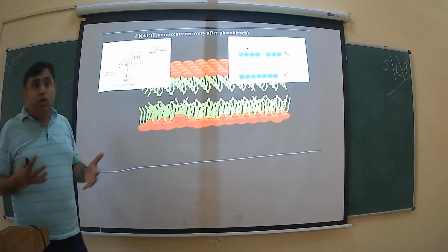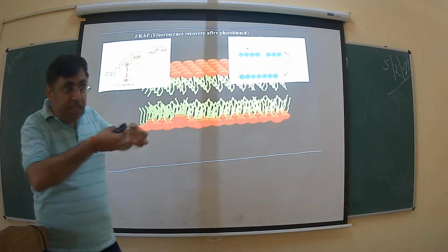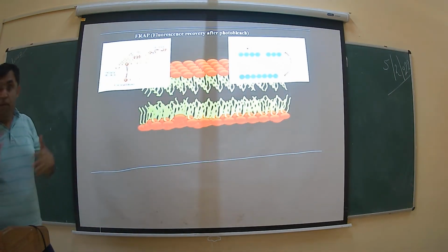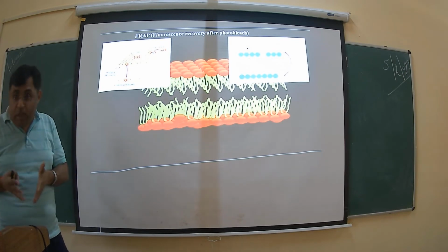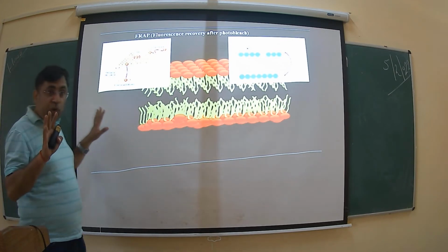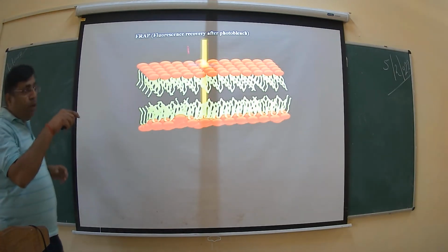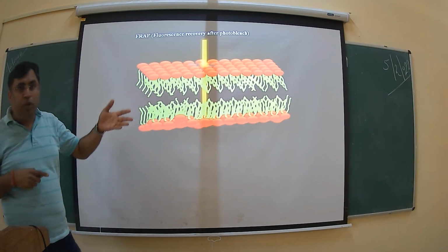So what is the diffusion coefficient? The movement of a protein molecule in a particular structure, you measure through FRAP, fluorescence recovery after photobleaching. Okay, FRAP. You got this point? Is that clear? So if you understand this one, then it is very easy to see what exactly the phenomenon is that is ongoing. Anyone, in this slide, what phenomenon is ongoing?